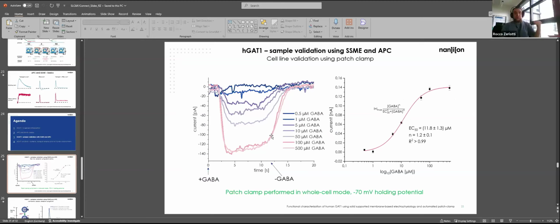So this is the sum of 4 cells. I tried with a single cell chip and I didn't see anything, even at minus 70 millivolt. I also tried with the 4X chip at 0 millivolt, and I didn't see any current. So it becomes too small to be detected.